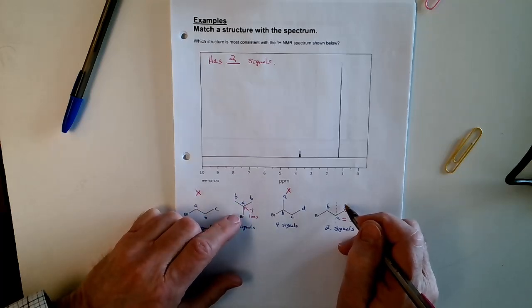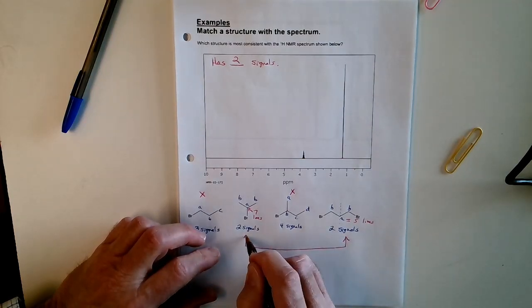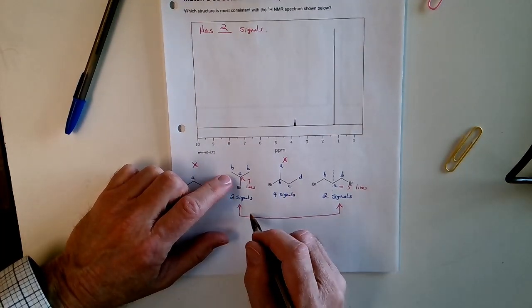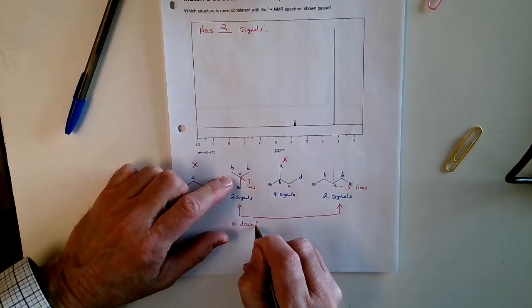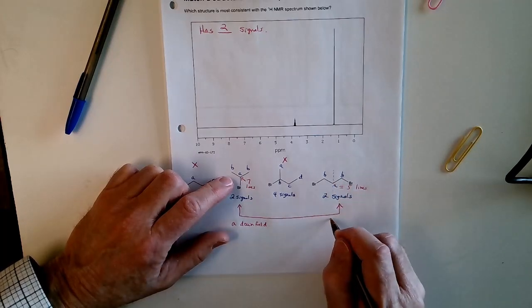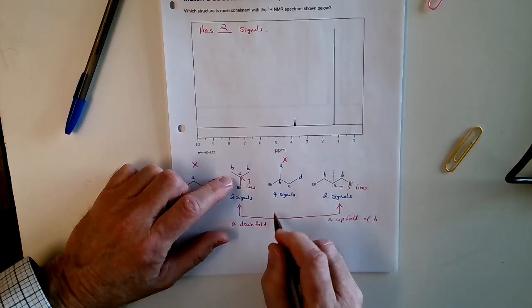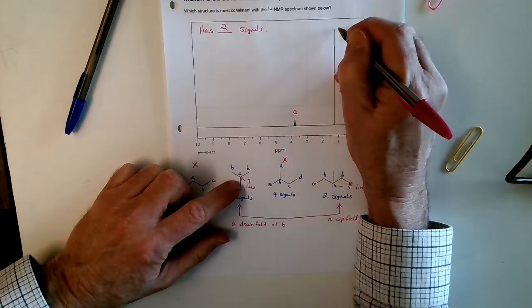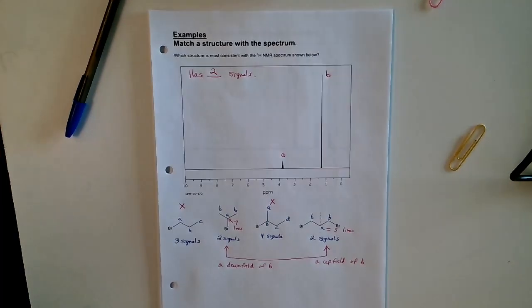But what you want to look at is now the fact that if you compare these 2 options as the only ones that are left, you'd see that the bromine is on the middle carbon, and of these 2, A should be downfield compared to its partners, versus this one up here, where A should be upfield of B. And it's pretty safe in both cases to say that we're looking at A and B. They're the same. You'd expect that out of either of those two options.